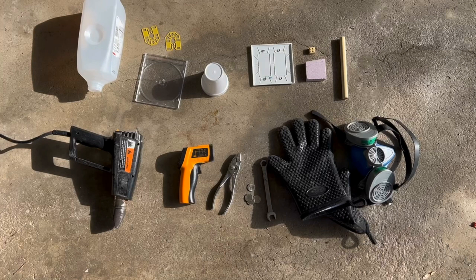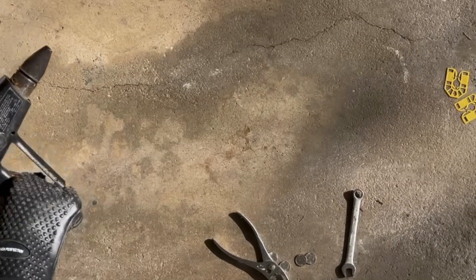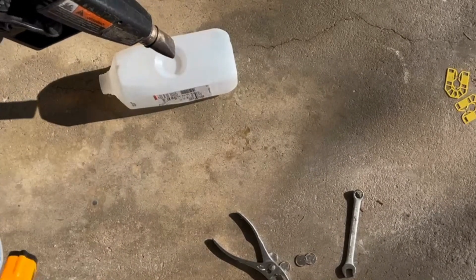I'll be wearing the respirator on the right to prevent breathing any toxic fumes produced by plastics that don't melt when heated but instead undergo a chemical reaction and produce new substances. I'm also wearing oven gloves to protect my hands as I use a high temperature heat gun to blow hot air onto each plastic.